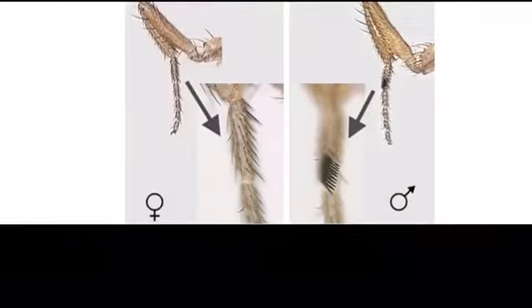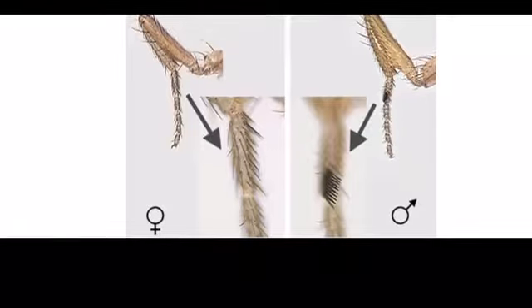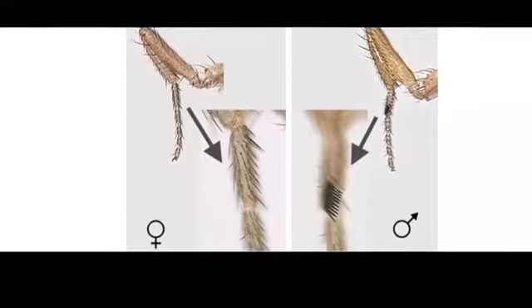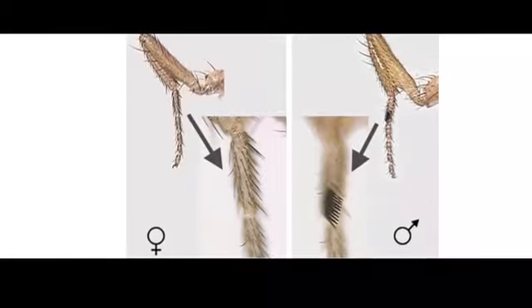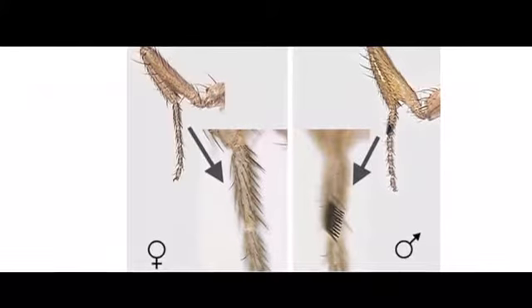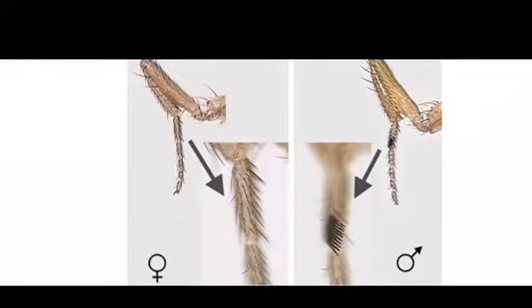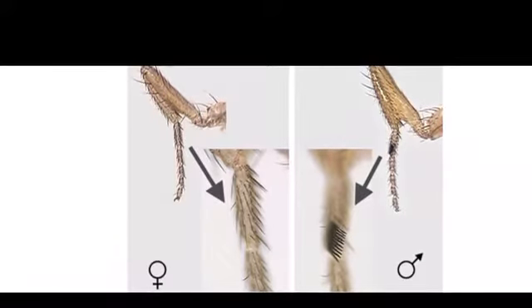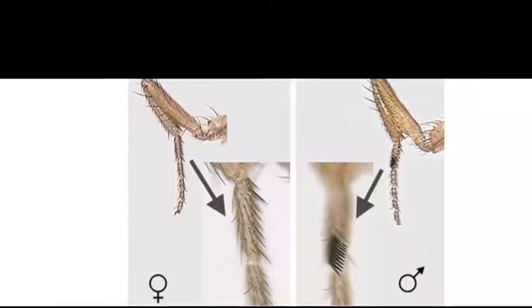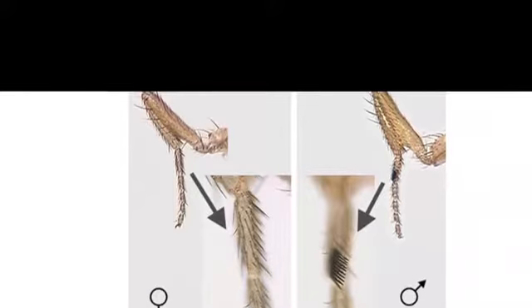It is important to know how to find the sex of a fruit fly. The sex of a male fruit fly can be determined by observing the front legs and noticing the sex combs. Males use their sex combs to grasp the female's abdomen and genitalia and to spread their wings prior to mating. Female fruit flies do not have sex combs on their legs. Male fruit flies also have a darker pigment on their abdomen, while females do not.